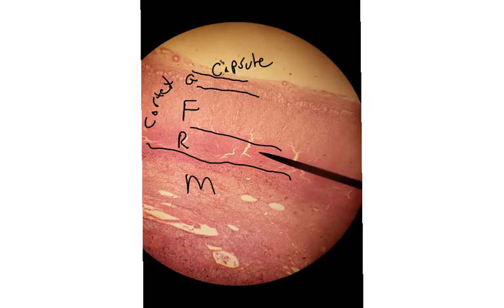And those are some confusing names, but something that's now pointed out here is GFR. And that's a phrase that you recently used in the kidney chapter. So, if you can remember GFR from kidneys, then just remember GFR for the adrenal cortex. Zona glomerulosa, zona fasciculata, zona reticularis make up the adrenal cortex. Below that, the adrenal medulla.